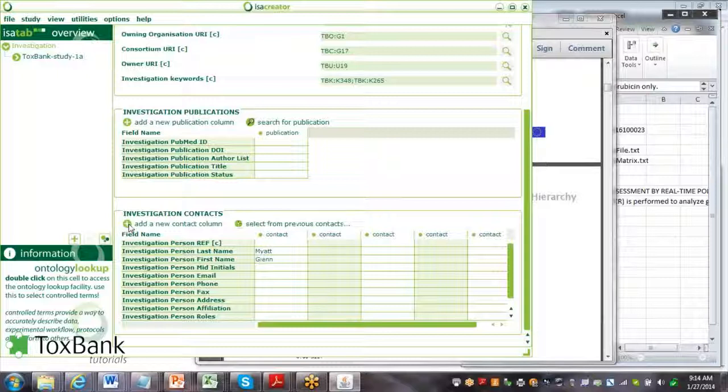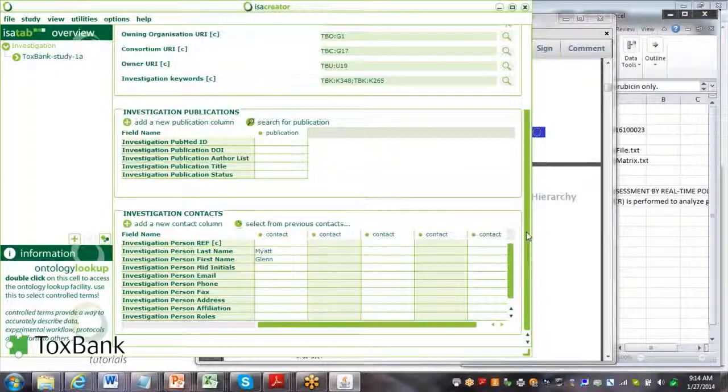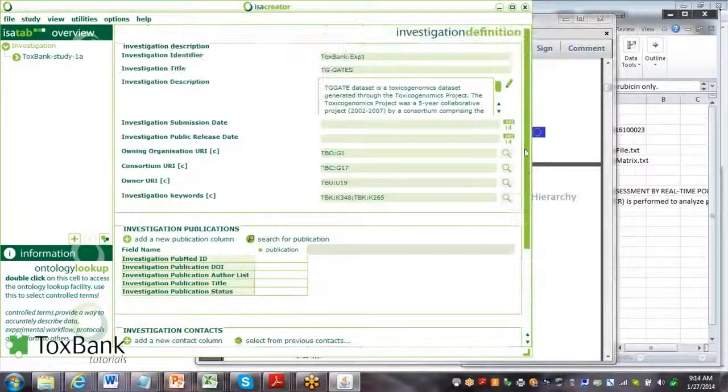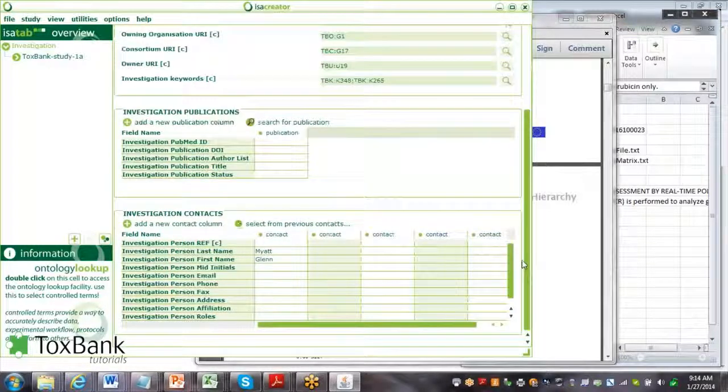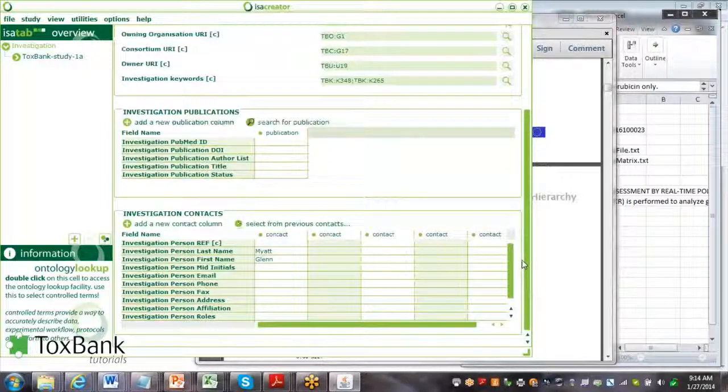To summarize, that shows how we can create a high-level description of an investigation. The next step is then to create one or more studies, and we'll show that in the next tutorial.